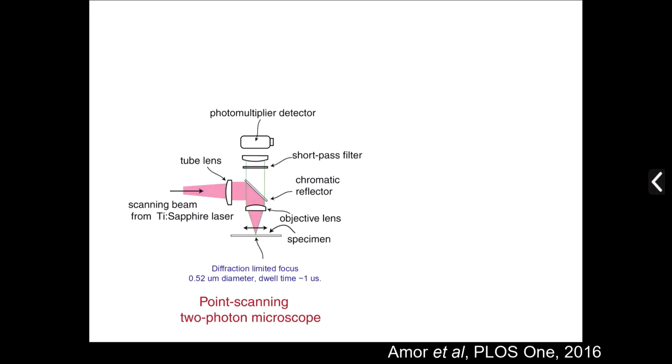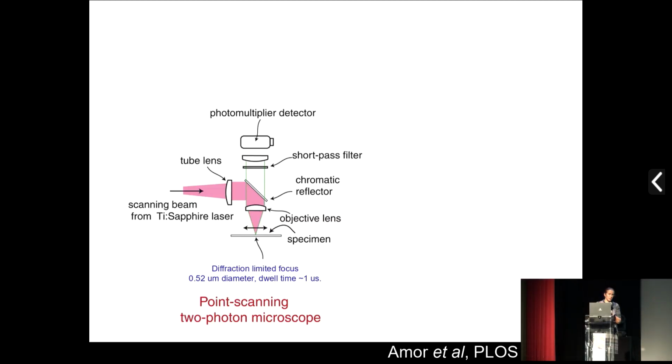Because the previous speaker was talking about multiphoton, I realised that there might be an opportunity to speak about some completely unpublished work. I'll publish it eventually whenever we can. And it's trying to upscale the Mesolens for multiphoton mesoscopy.